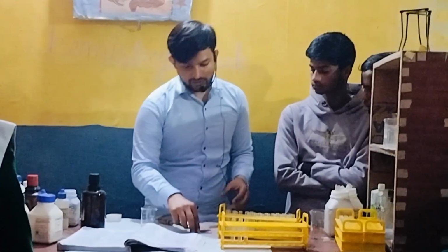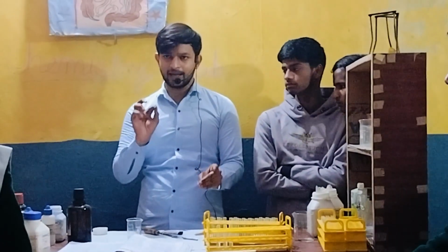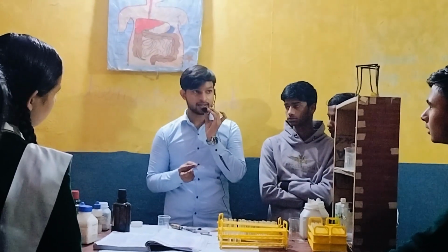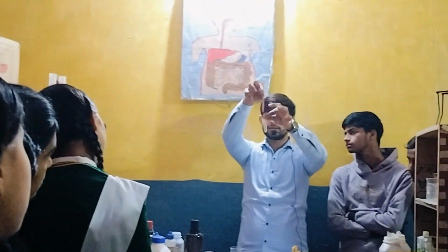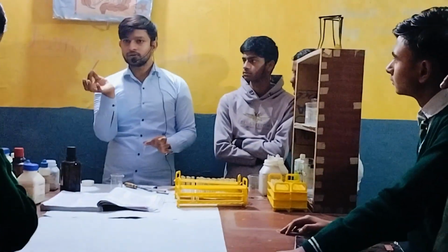Now, if we put this red litmus paper into water, can you tell me anything happens? No, because water is neutral. So this is water. Yes. So let's confirm. See, nothing happened. Nothing happened. So do you get to know the role of litmus paper, red litmus?